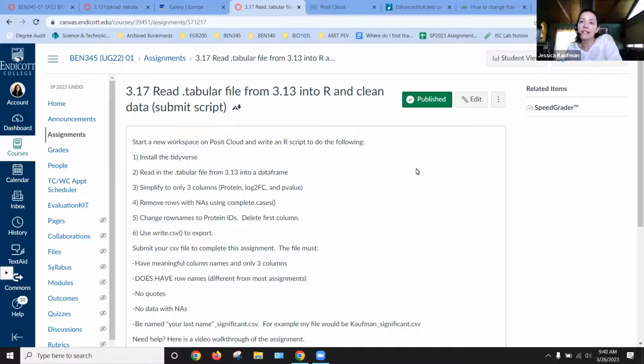I'm going to walk you through the steps to analyze data from these Galaxy proteomics experiments in R. Galaxy is great. It has a lot of tools. It actually has some built-in visualization tools.